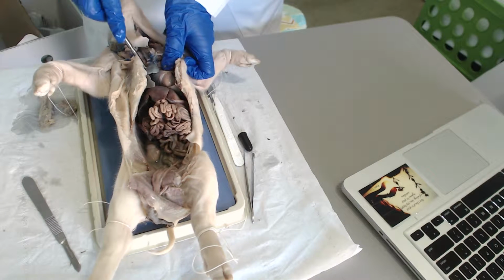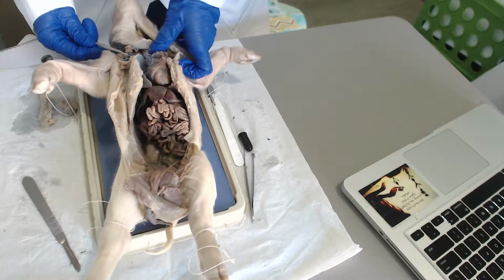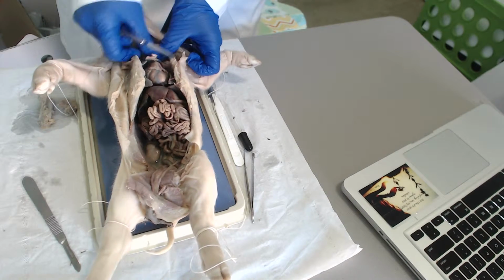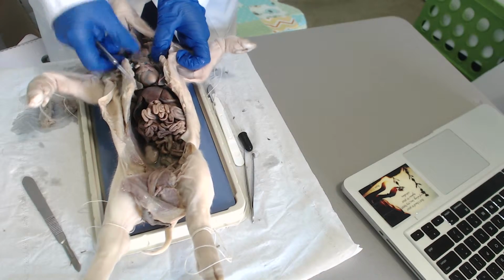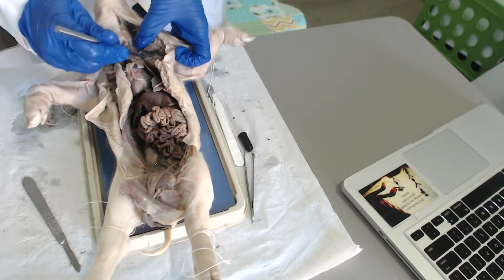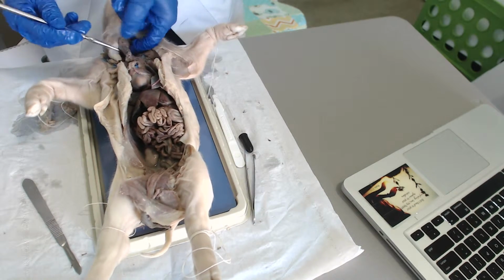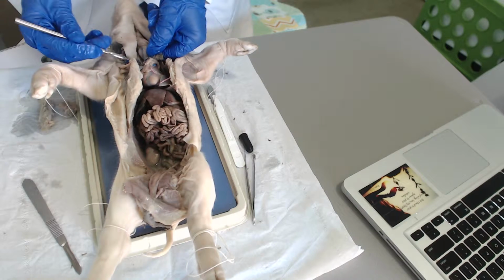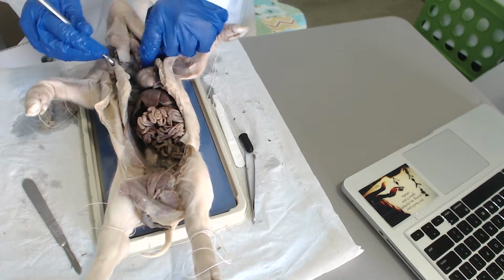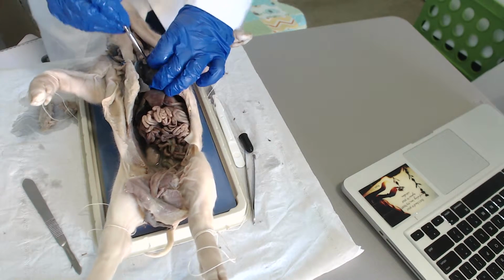If you push back the lung, you can see where the trachea actually leads down to each side, the bronchi. There's a little tubing right here. Okay, so the bronchi, like I said, you follow the trachea and you'll find the bronchi right here on each side.